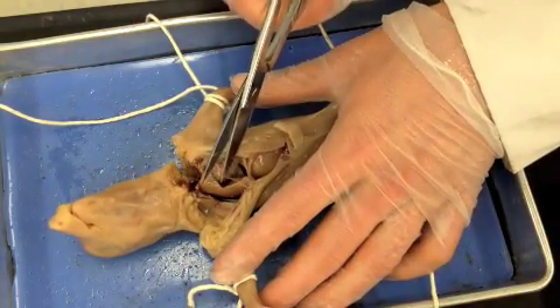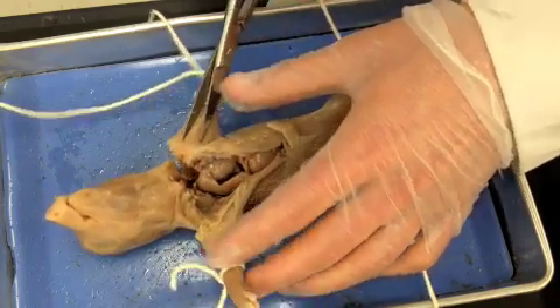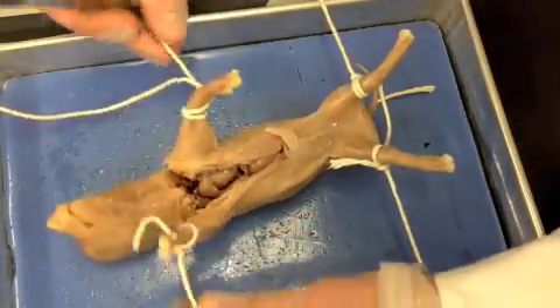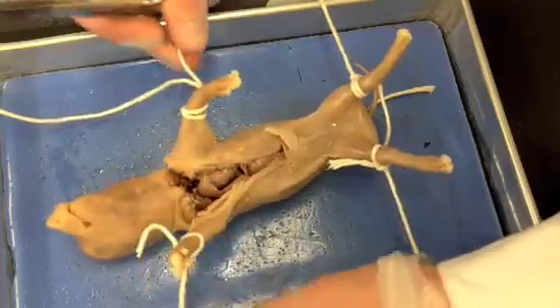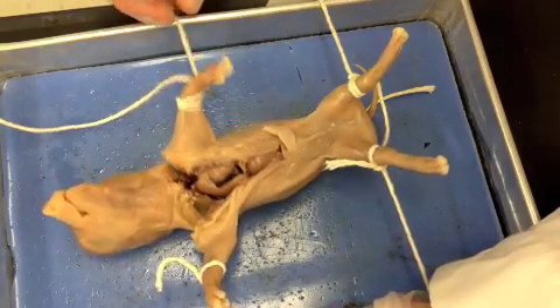This white, clear stuff right here is called connective tissue — it's a glue that kind of holds everything together. As you're doing this, you'll notice that the skin starts to get floppy because it used to be tight up here. Now that you're separating it, it starts to fall to the side.